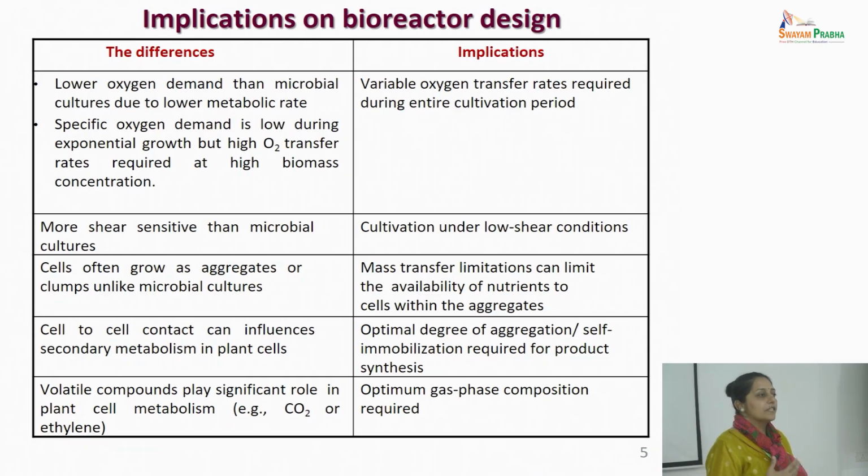What we observed, despite the fact that we had done all the optimization at the reactor level with such high cell densities, we were around 900 grams of fresh weight in nearly 2.4 liters of the medium. By the end, the cells had settled at the bottom of the reactor. Even though the mathematical model predicted that we would reach 39 grams per liter, what was the assumption there? We did not take into account the non-Newtonian behavior. So viscosity for us was the same.